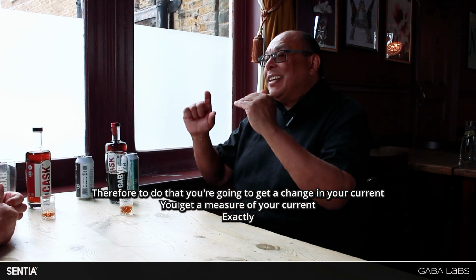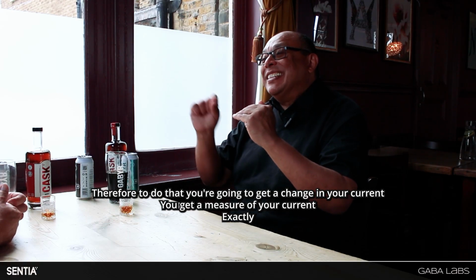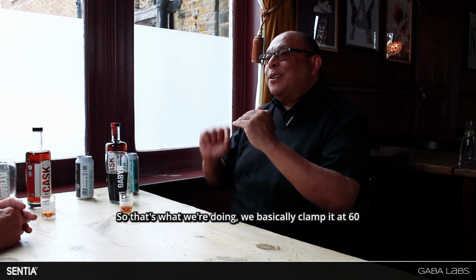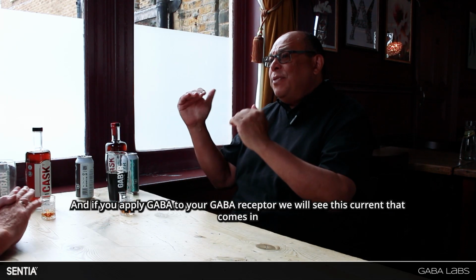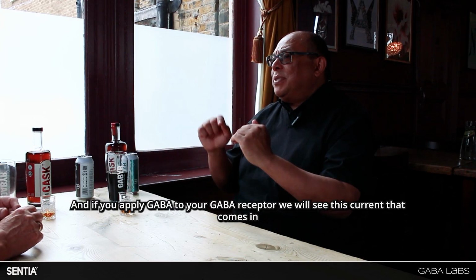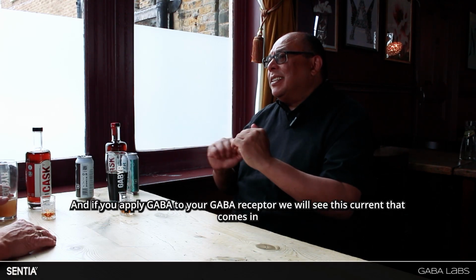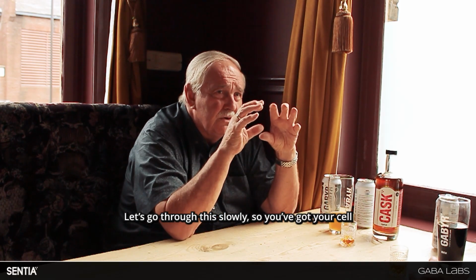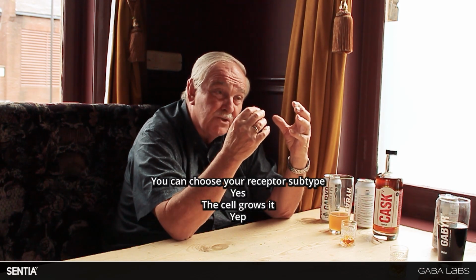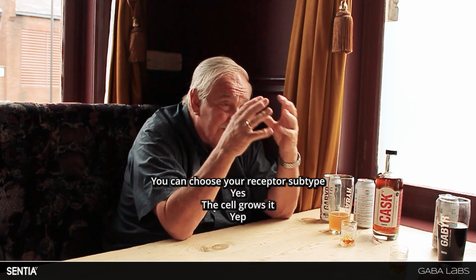Therefore, you're going to get a change in your current. You get a measure of your current. So that's what we're doing. We basically clamp it at minus 60, and if you apply GABA to your GABA receptor, we will see this current that comes in. Let's go through this slowly. You've got your cell and you can choose your receptor subtype.